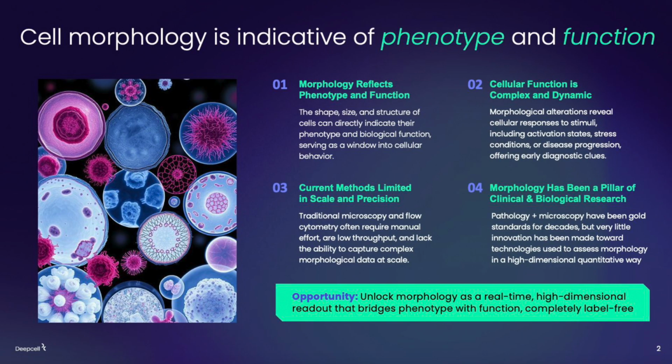Morphological characteristics provide a window into a cell's physiological state or pathological condition, both of which we will actually explore today, making morphology a cornerstone in experimental and clinical contexts. While molecular diagnostics and multi-omics technologies are advancing rapidly, morphological assessment remains indispensable for disease diagnosis, monitoring progression, and guiding therapy.